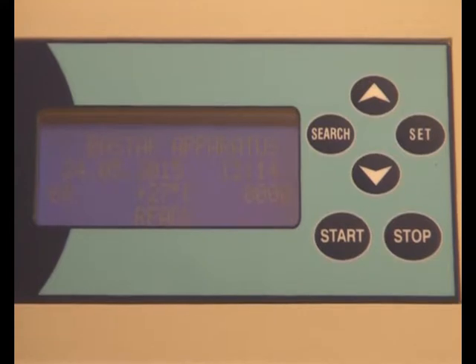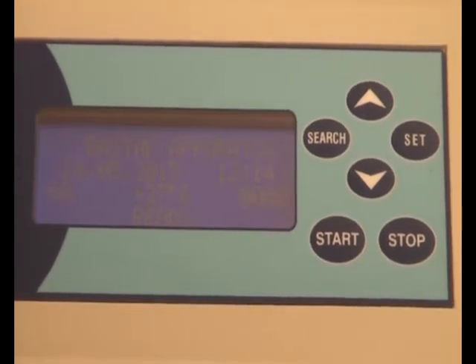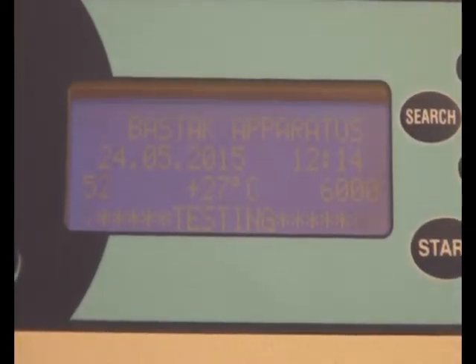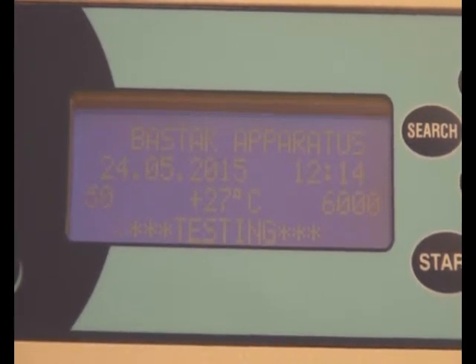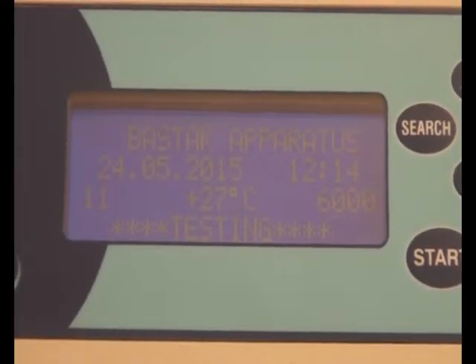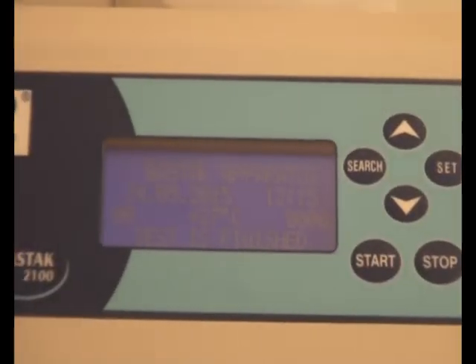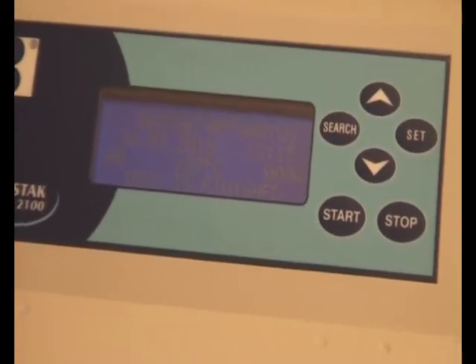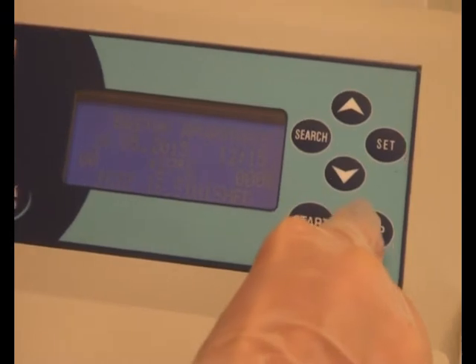Close the cover of the instrument and press the start button. After the finish alarm, press the stop button and open the cover.